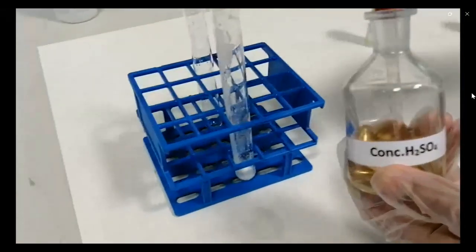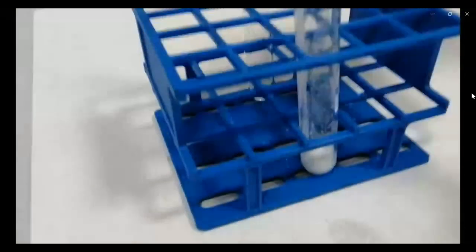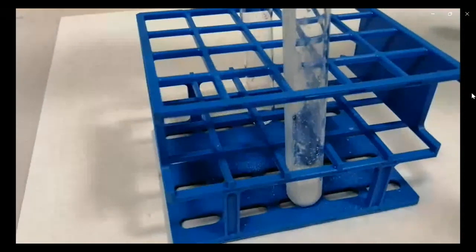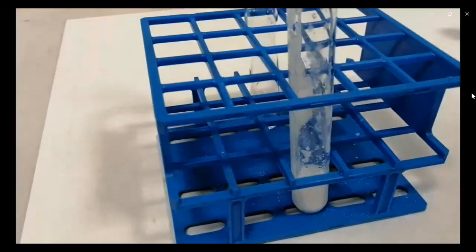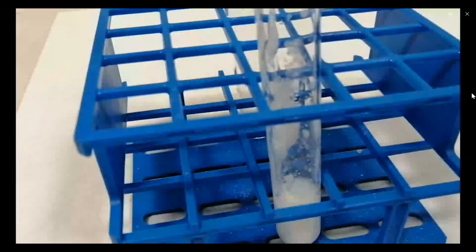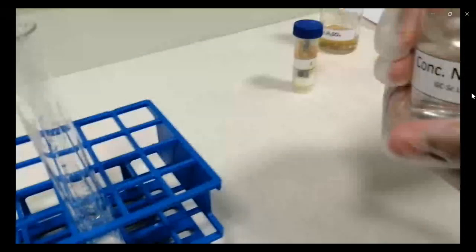You will see a very strong reaction, and HCl gas is evolved. You can see the effervescence. This gas is HCl gas, which forms white fumes with ammonium hydroxide.